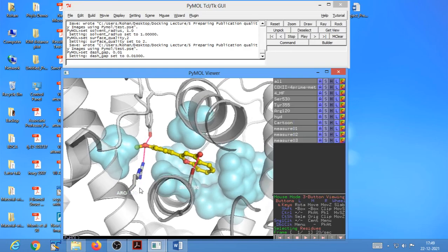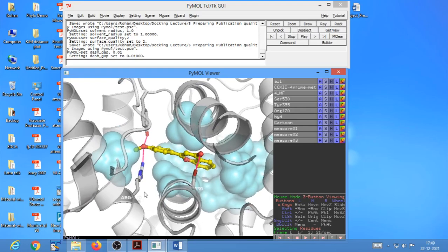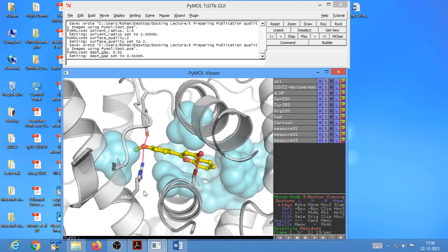I like the typical ball and stick CPK representation, that is why I am doing this, right? So when we change the color to white, somehow the color of the label has also changed. Well, now there is an option to change the color of the label, right?